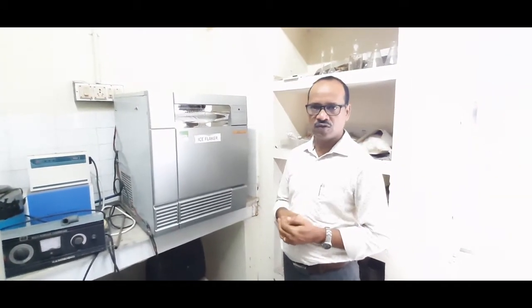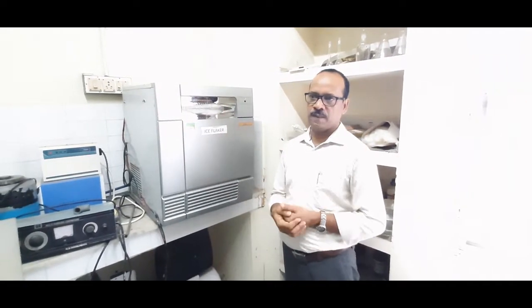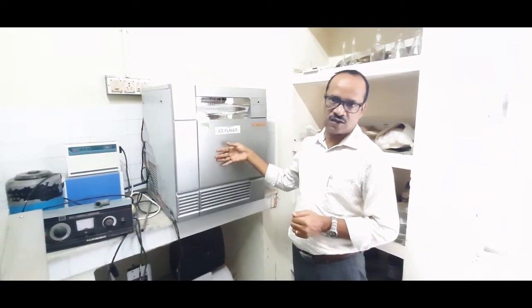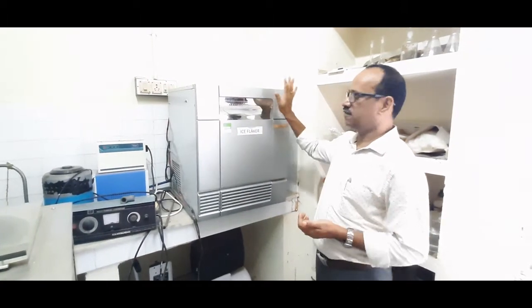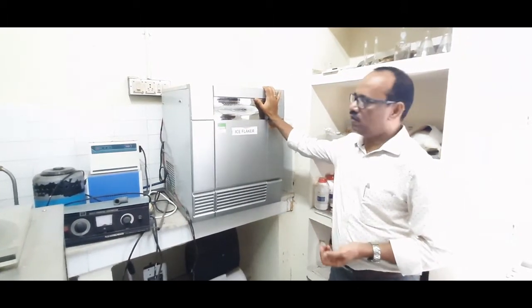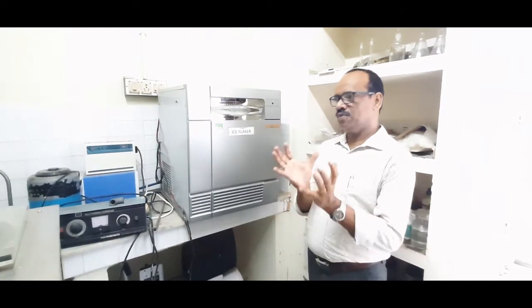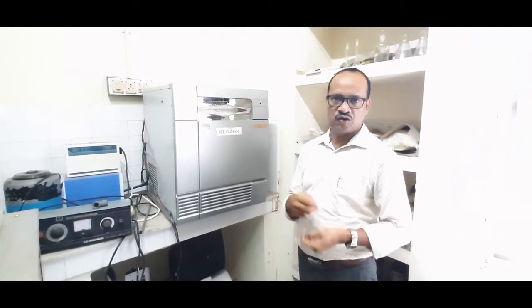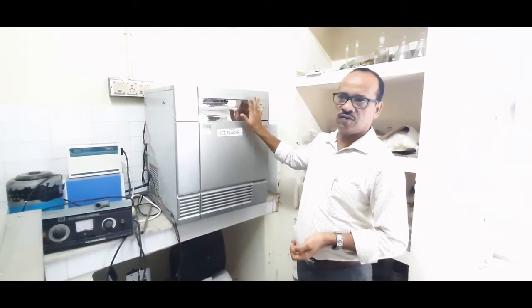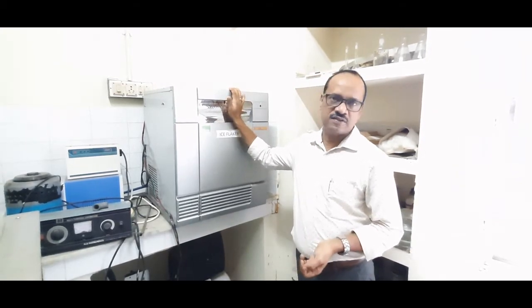When you transport samples or take samples out for adding chemicals, you should use ice flakes. This is an ice flaker or ice maker that manufactures ice flakes. It has baskets where you can immerse the samples whenever you are doing an experiment. This is another important piece of equipment necessary in any molecular biology lab — you should always have ready-made ice whenever you start an experiment.